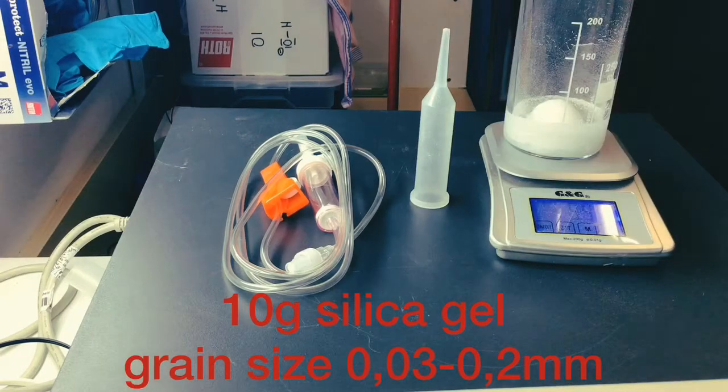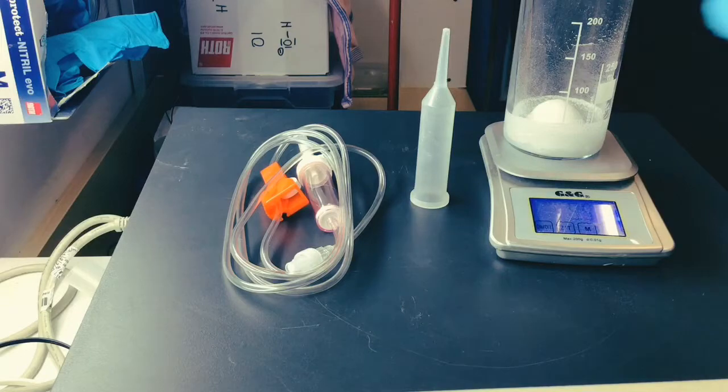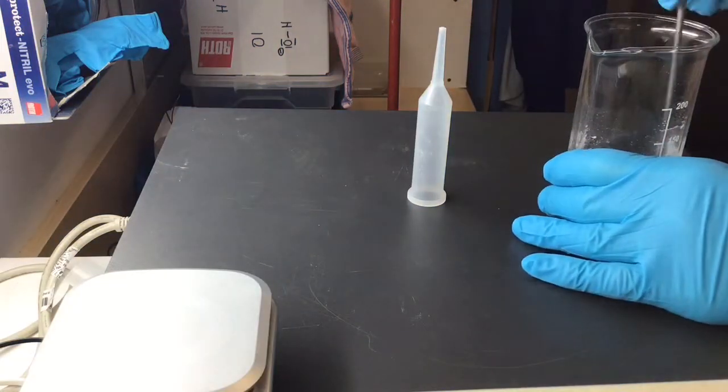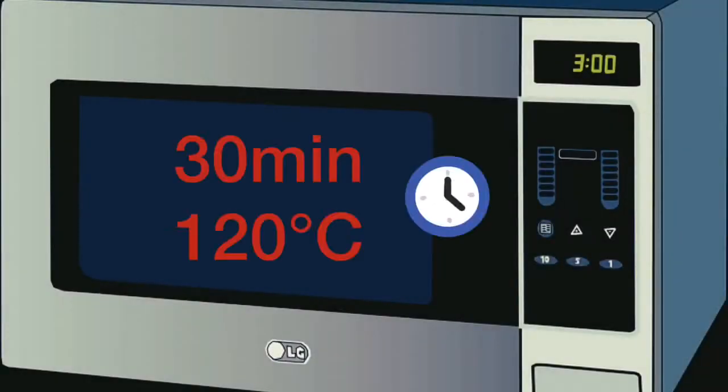Add 10 grams of silica gel and mix it with the oil. For drying, incubate in the oven for 30 minutes at 120 degrees centigrade.